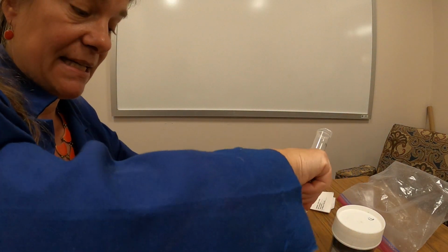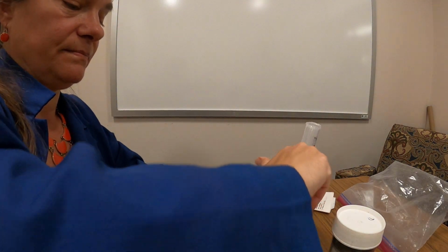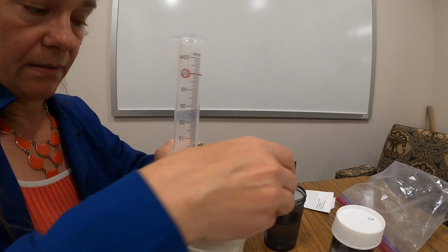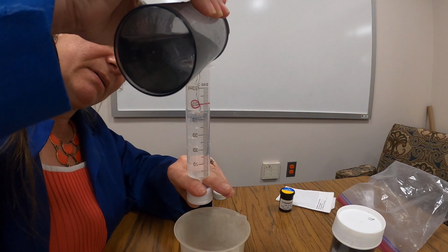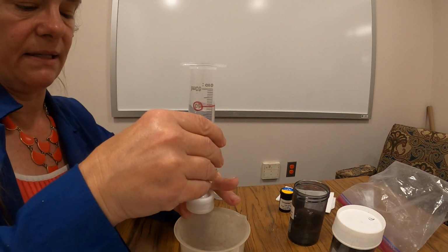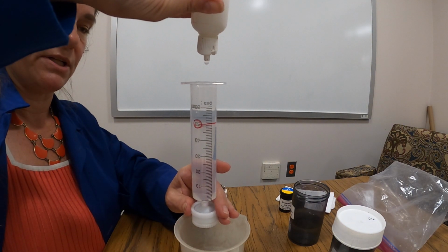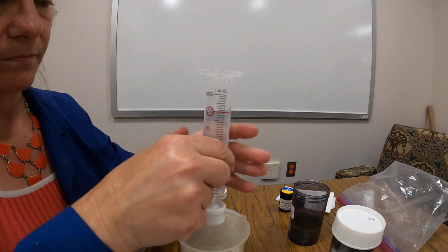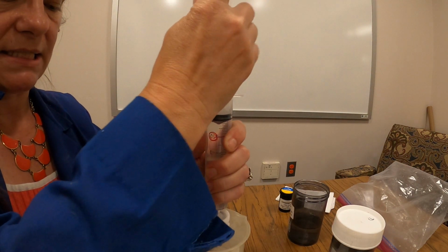I'm going to carefully cap my sample again, tighten it, mix it. Again with my finger on the bottom so no water goes through until I am done measuring. I'm going to pour another 50 mils in right to the bottom of that meniscus, that curvature. I'm going to mix my magnesium again because it separates really fast. Add my 4 or so drops. Carefully put my plunger in, pushing and twisting till I get that snap.